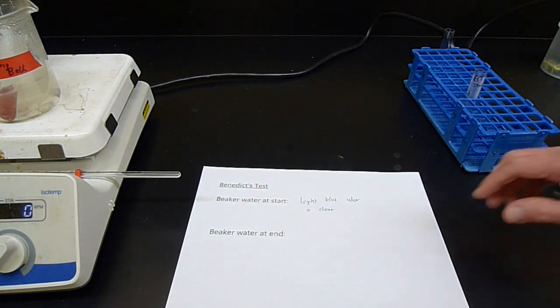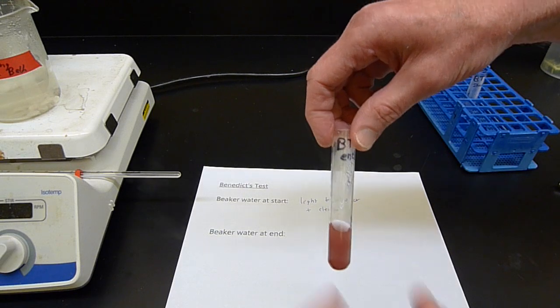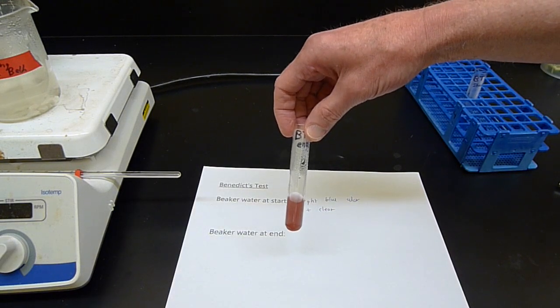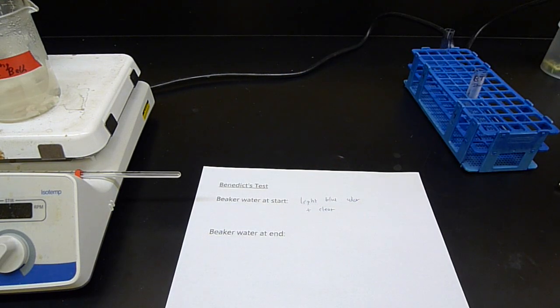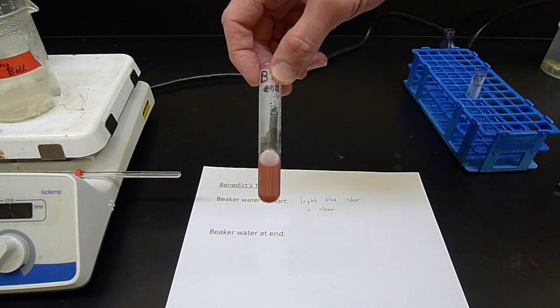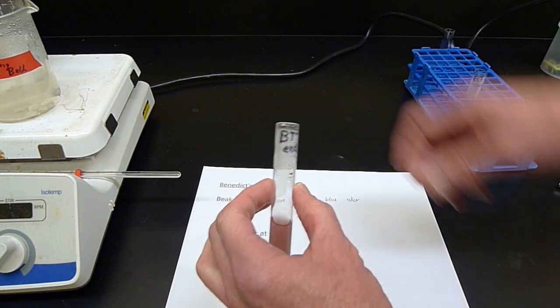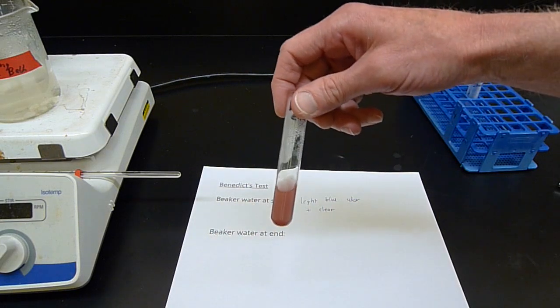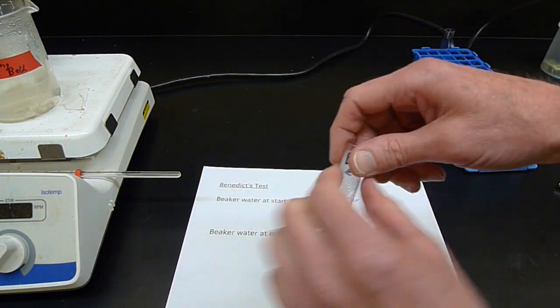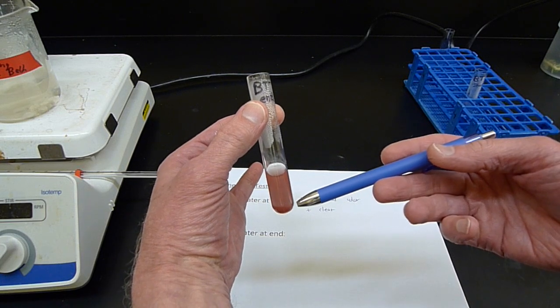By contrast, let's look at the tube at the end of the incubation period. Here, this tube is obviously not blue anymore. It's kind of reddish. And if you look closely, you can see some chunks floating around in there. Well, it's probably pretty hard to see in the video. In any case, it's a very different color. So I'm going to call this, well, you can see some of it starting to settle out here. There's a little bit of extra red at the bottom.